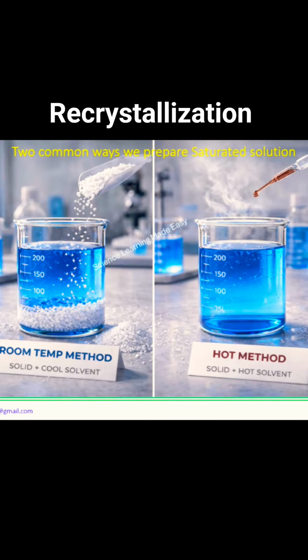First, room temperature method, adding solid to a solvent at room temperature until it simply stops dissolving. Second, the hot method, adding just enough boiling or hot solvent to melt that solid into the liquid.